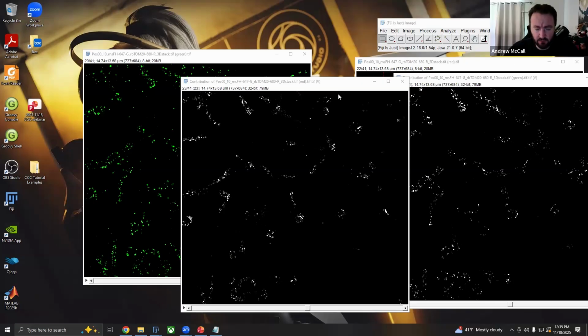The problem is that would use so much more memory to actually do, and takes significantly longer, repeating this process over and over again in order to basically get a distribution. Also, the few times that I did test this, it wasn't really helpful. Much like Costes' significance test, when you do that, you tend to get different results.